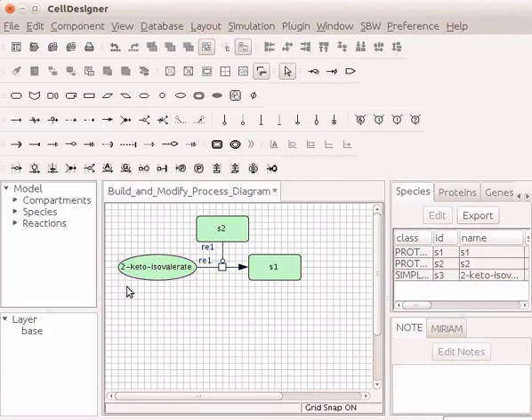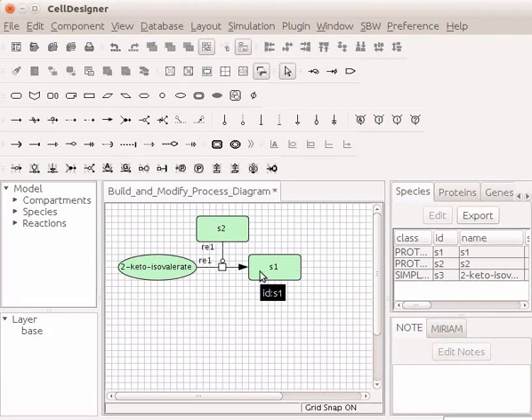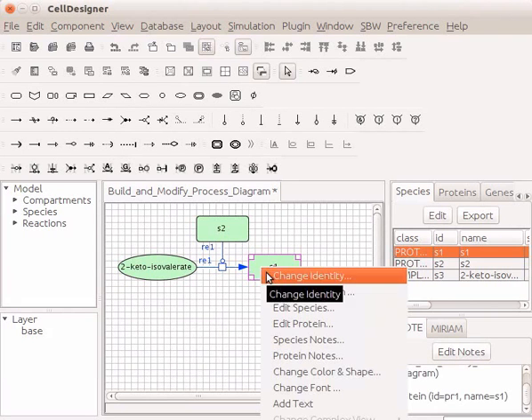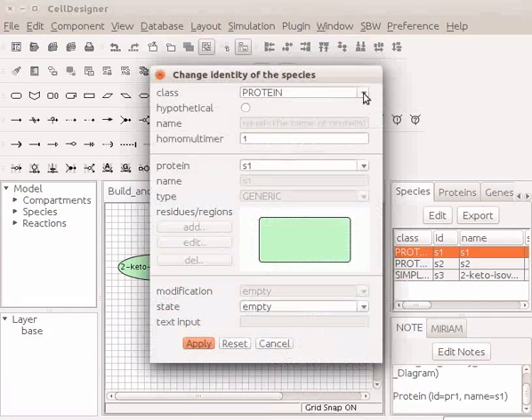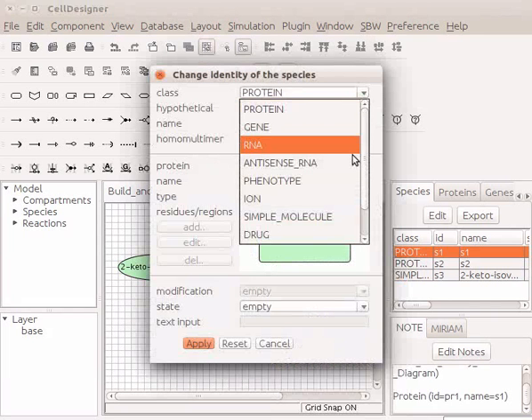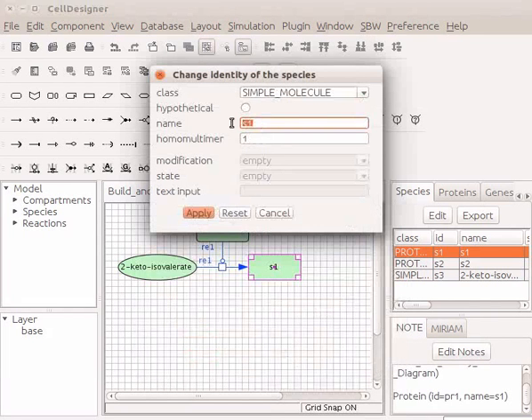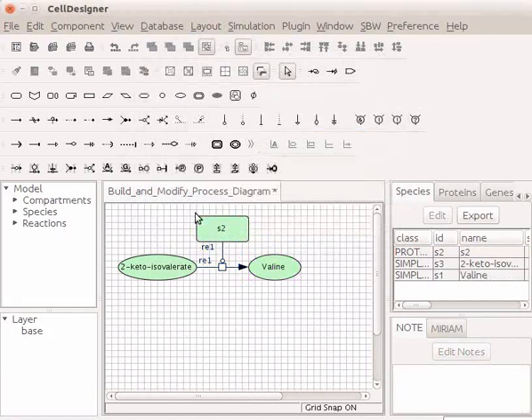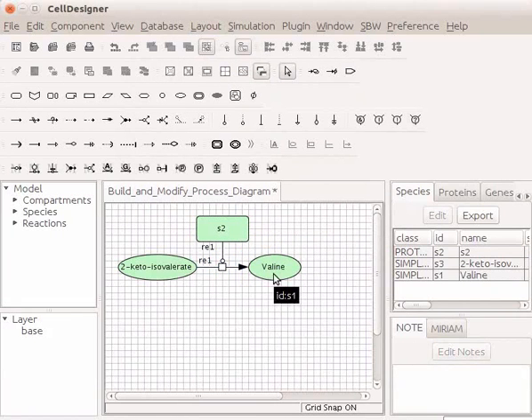Right-click in the center of the endpoint Generic Protein S1 which is a product. Change identity to simple molecule and name it Valin. Click on the Apply button. You have Valin on the draw area.